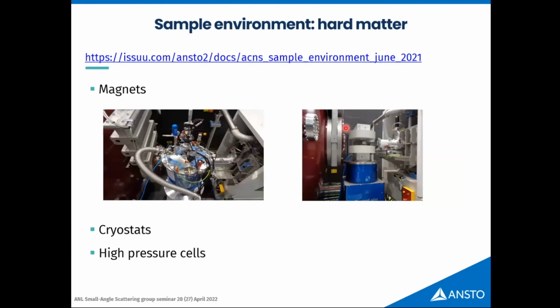When we're getting closer to finalizing, just a couple of words about hard matter, because Australia is quite a heavy industry country, I should say. It's really keen on metal work and geology. Therefore, hard matter, even in SANS, is getting popular, because usually people think SANS is only soft matter. I personally was quite keen to check what we can do for hard matter. It's not my pure scientific interest from my university, but it's quite interesting to see what the instrument is capable of. And also, of course, learn on the go what the materials are.